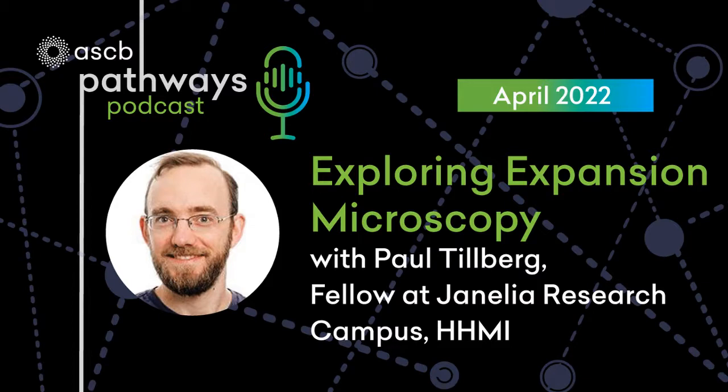So all of those are problems that ExM does not solve, but by expanding and then staining after expansion, maybe we can solve those problems. And quite a few groups are now working on that and making, I think, great progress in the past couple of years. And that's where I think some of the most exciting stuff is going to come in the next few years, is to see, can we really demonstrate that we improve antibody performance by doing it after expansion? Well, you can't solve a problem until you can see it, right? Absolutely. That's right. Necessity is the mother of invention.